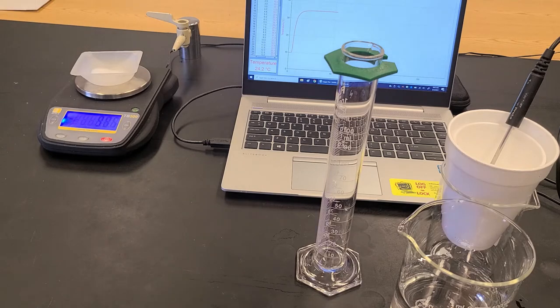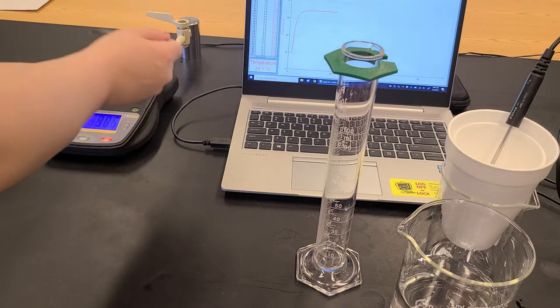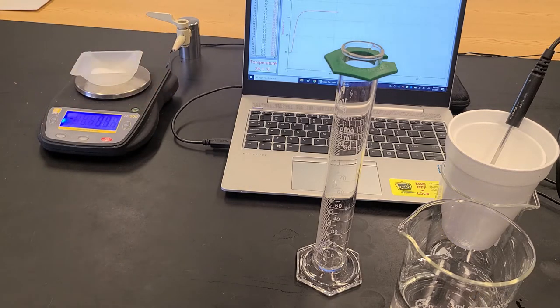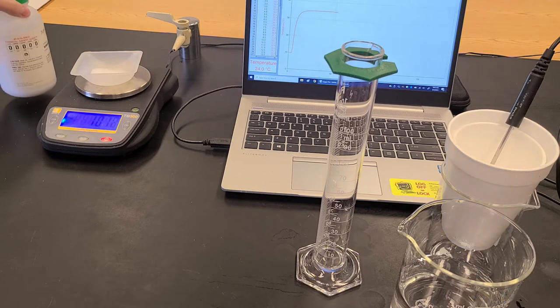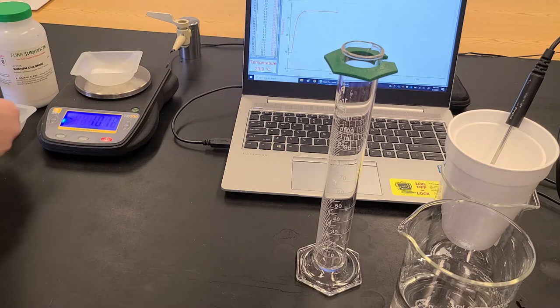So I'll take the heat exchange and divide by the moles of this solid and it will give me the heat per mole. So I've measured out my solid and recorded the mass that I'm starting with here.